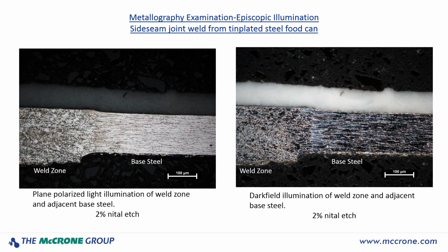We can also see the protective coating now is a nice bright white, and we can see that much more clearly at this point. But again, these things can be used then for other imaging manipulations with software and so forth if you're trying to do some quantitative work with that.